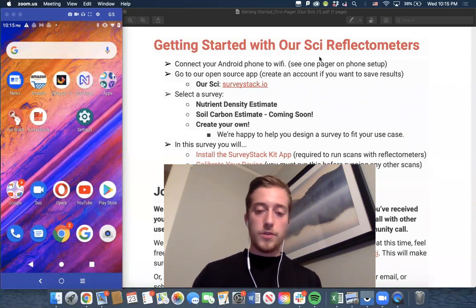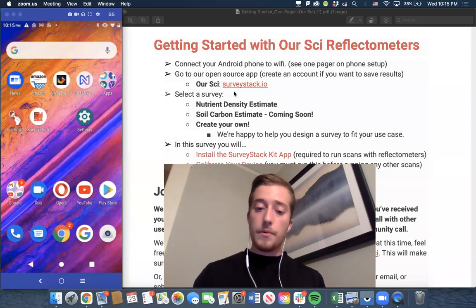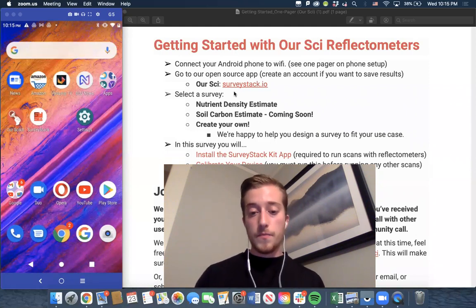Today, we're going to continue to just go through this one pager that comes with your kit. In a previous video, we set up our Android phone and connected to Wi-Fi. So now we can get going with going to the app. If you're an Our Sci user, you should go to surveystack.io. If you're a BFA user, you should go to bionutrient.surveystack.io.